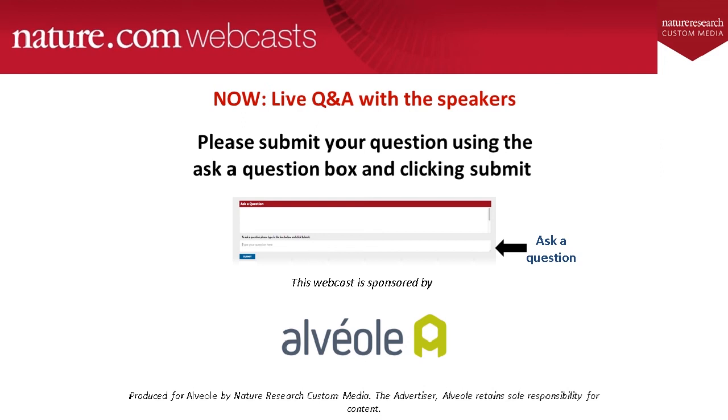Excellent. Thanks, Leeya. Our next question asks whether you can talk a little bit more about the silicone stencils you use to immobilize the grids. Are these harmful to the carbon film?